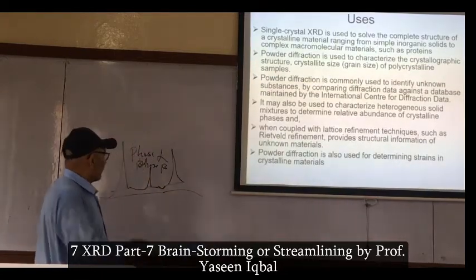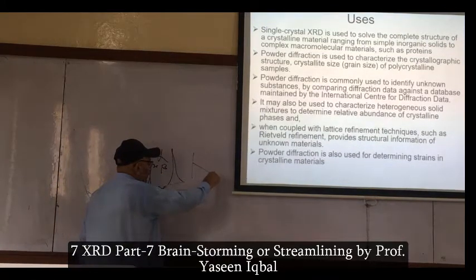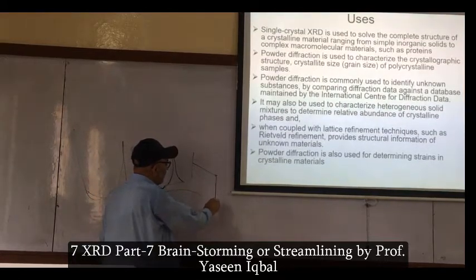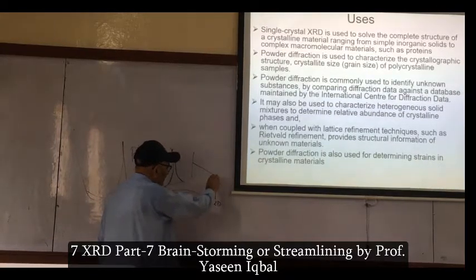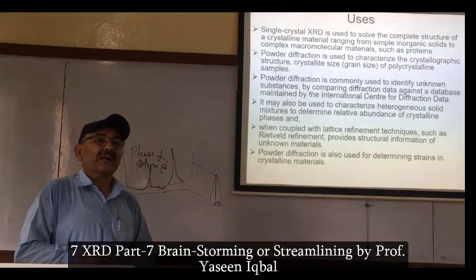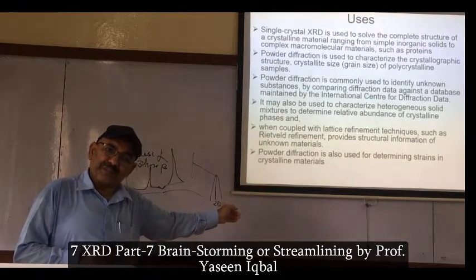Similarly, the spreading: if a plane is here and it is directed to this point, then we should have points at this angle. Why are we seeing this? This means that we are transforming information and it is spread around that central position.